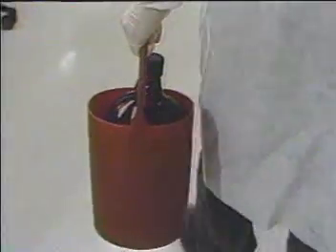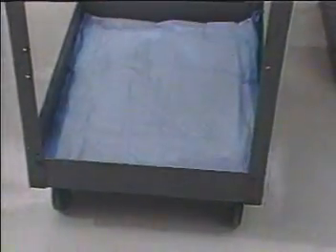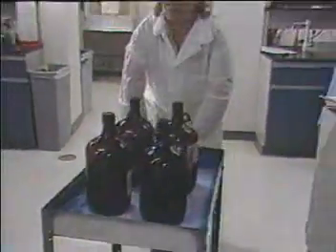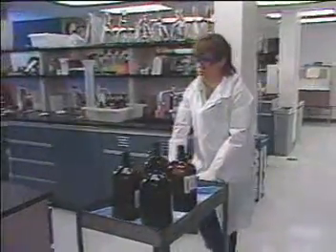Transport flammable materials in secondary containers. Rubber acid carriers are a good choice, as are plastic jacket overpacks. Carts should have large wheels to cross uneven surfaces. Do not use instrument, equipment, or mail carts. They are too easy to tip over or knock chemicals off of.